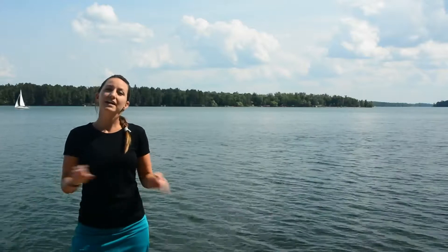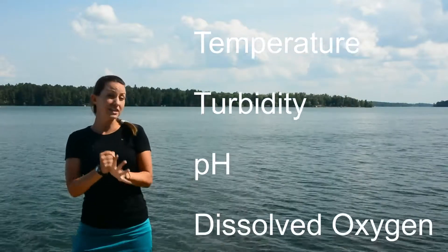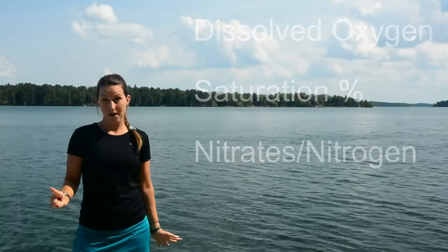We're going to be testing for temperature, turbidity, pH, dissolved oxygen, saturation percentage of that dissolved oxygen, and nitrate nitrogen amounts.